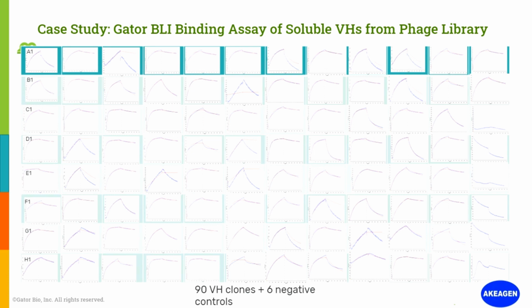And for this part, Indrani will give a detailed presentation. So combined with the periplasmic samples from the immunized libraries, we can quickly generate the leads.